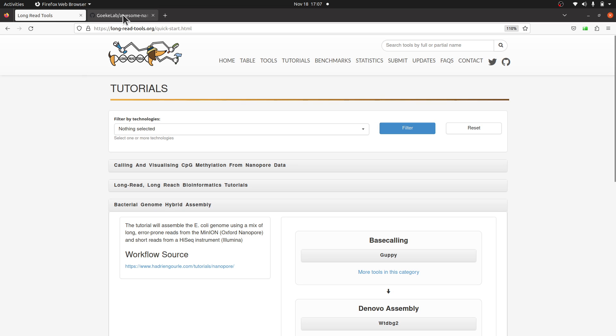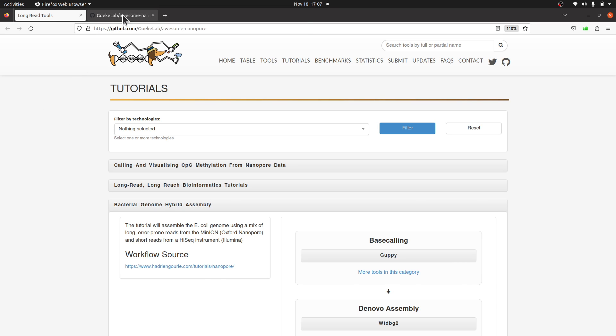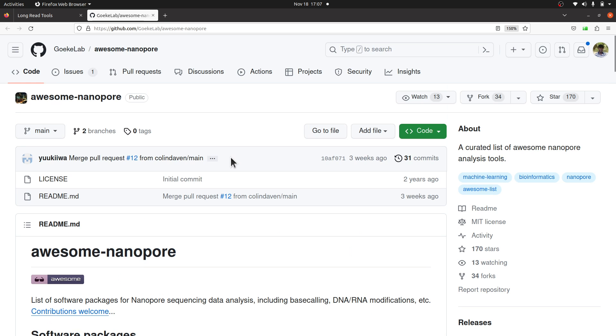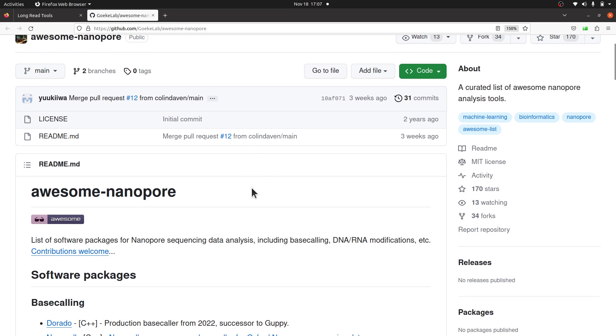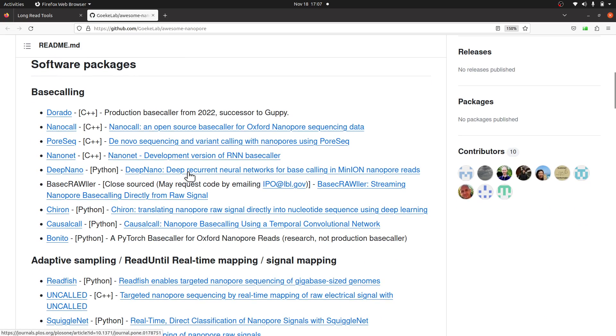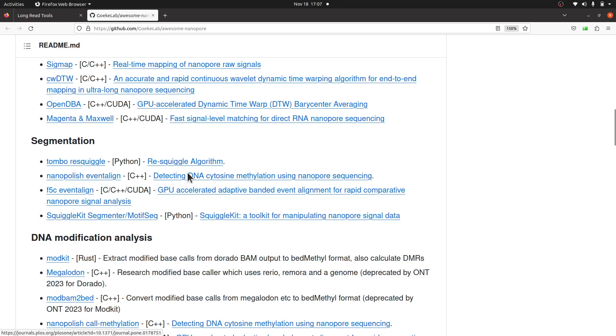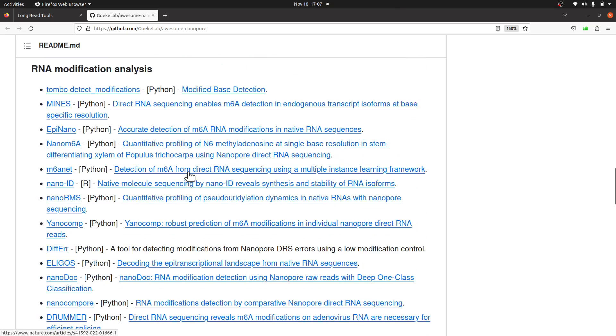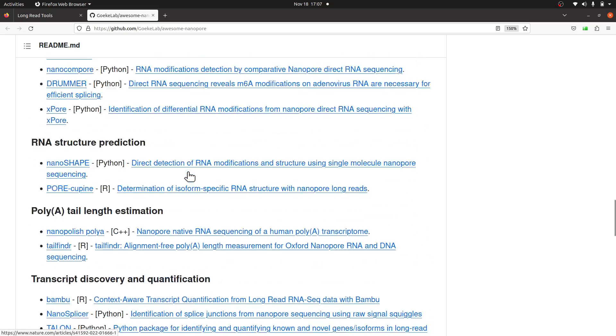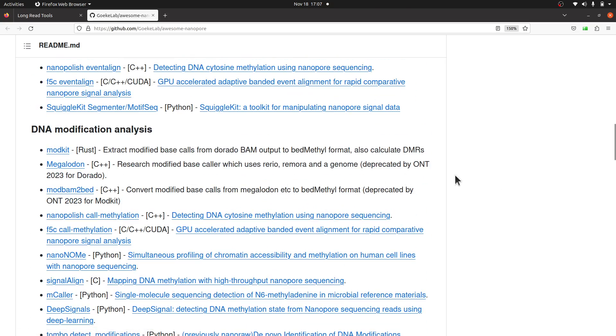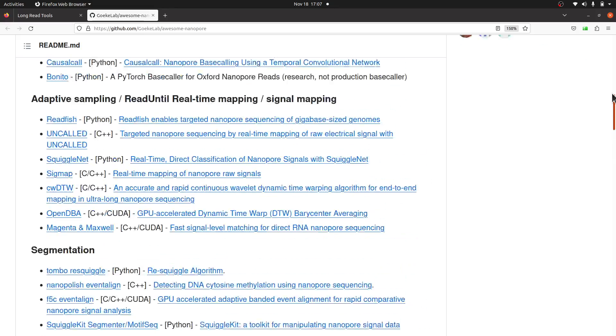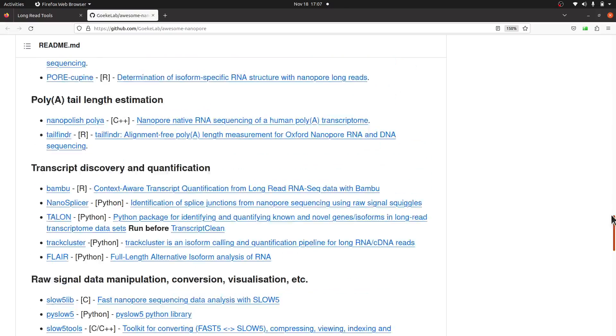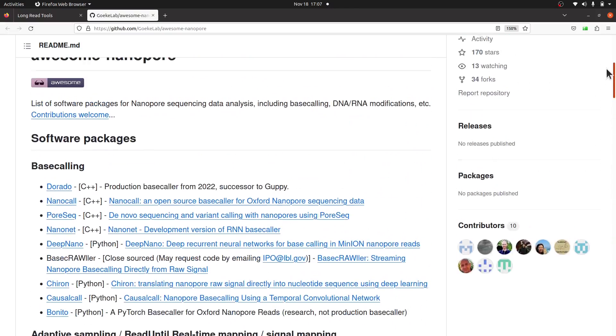Basically, the page is yours—it's a publicly available website or database. So just check it out and then make sure you search and get what you want. There's also this resource that I saw just before I started recording this video. It also says 'awesome nanopore.' This one is a list of software packages for nanopore sequencing. We have some lists here. I think there's also an extensive list, so you can just check it out, read, and look at tools that can help you analyze your data.